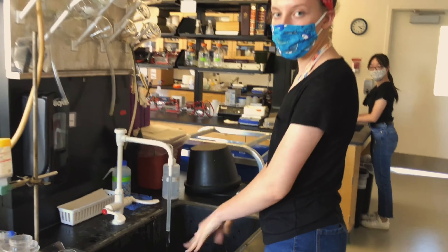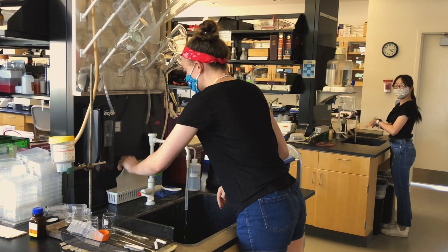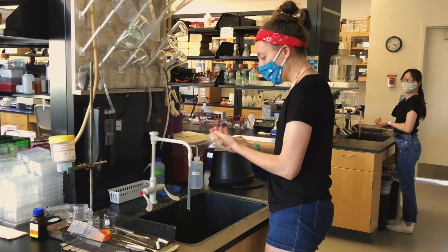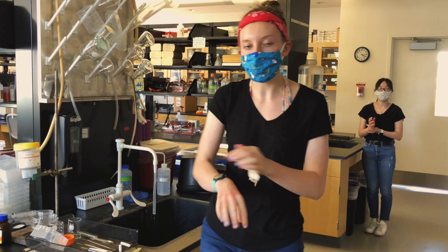After you are done washing your hands, grab a paper towel and use the paper towel to turn the water off. Then dry your hands and throw the paper towel into the garbage.